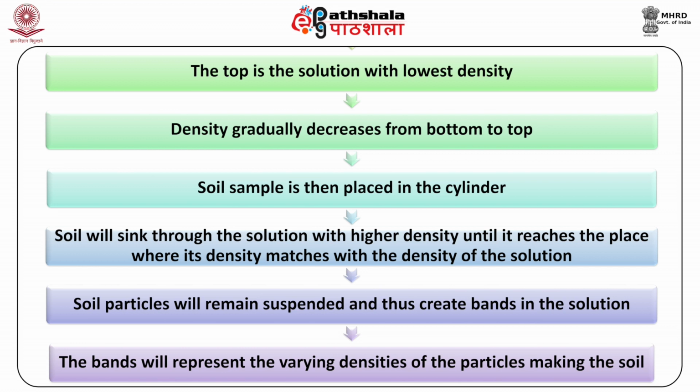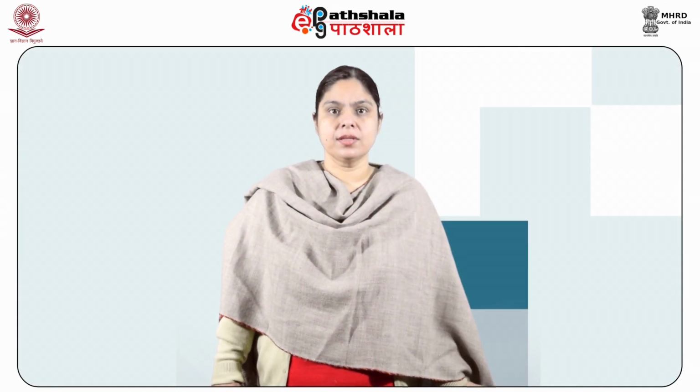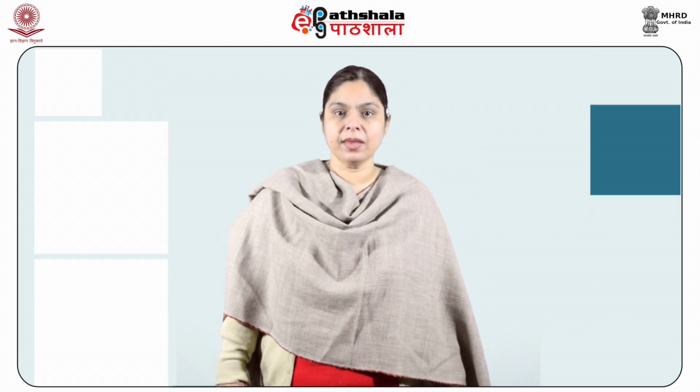These bands represent the varying density of the particles which make up the soil. Soil samples from the same origin will produce similar bands through this method.